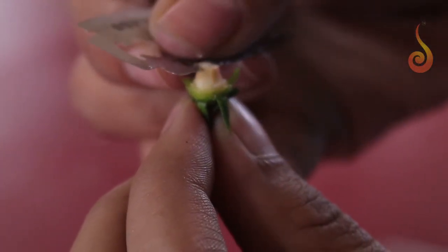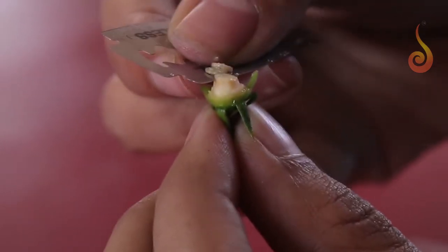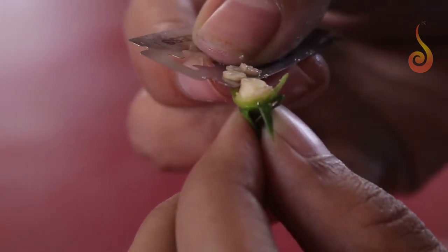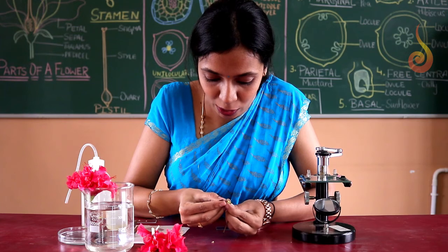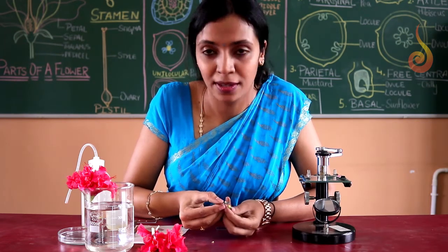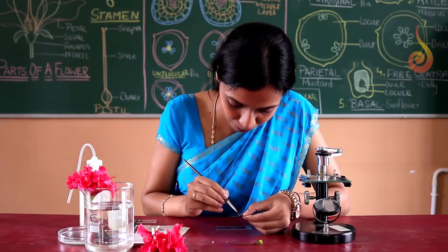You can take many thin sections. You will have to show only one to the examiner. You can take as many as 4 or 5 and show the best one to the examiner. So this we are performing to observe how many locules the ovary has and also what kind of placentation hibiscus shows. So right now I have with me many sections, of which I am going to pick the best one.